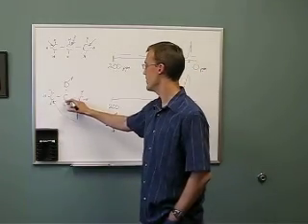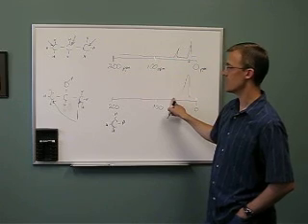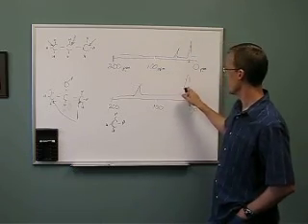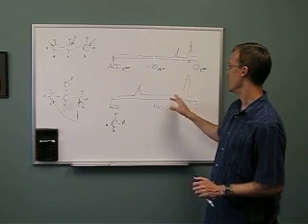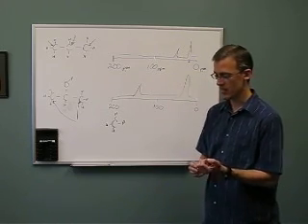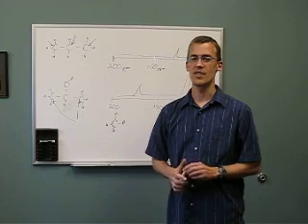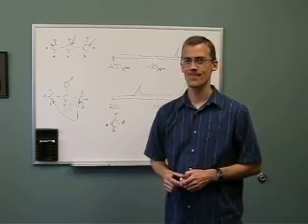And then we have this middle carbon, which we knew was going to be downfield because it's internal, but because it has this alcohol group, it's going to be way down here. And so, once again, we get maybe a 2-to-1 ratio, which tells us something about the amount we have, and how far downfield tells us a little bit more about the identity of things. Now, in lab, you're going to see some longer molecules, some branched, some things a little more complicated, but I think hopefully with the tools you have, you'll be able to make sense of it. So, have fun.